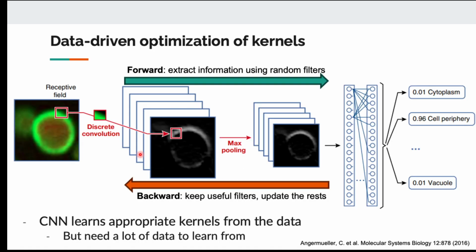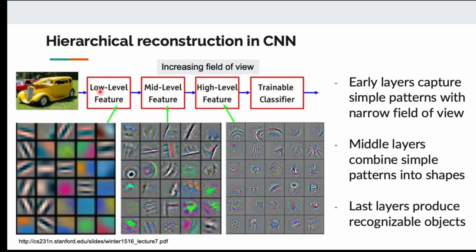And what happens inside the model is that at the beginning, at the first layers of convolution, they're not very smart. They're just detecting simple changes in the image. But the middle layers, the lower layers, when people tried to extract what the convolution is doing in the middle or at the bottom of the model, people found that these convolutional neural networks are able to put together these simple lines into geometric objects and eventually into something that resembles parts of a car.